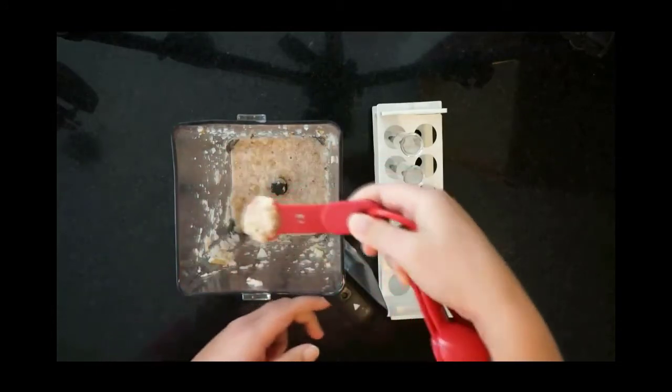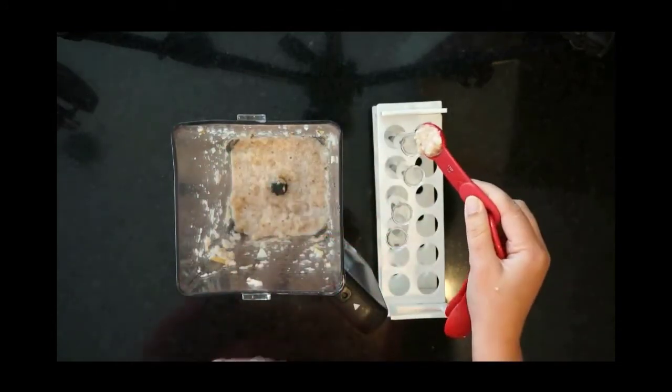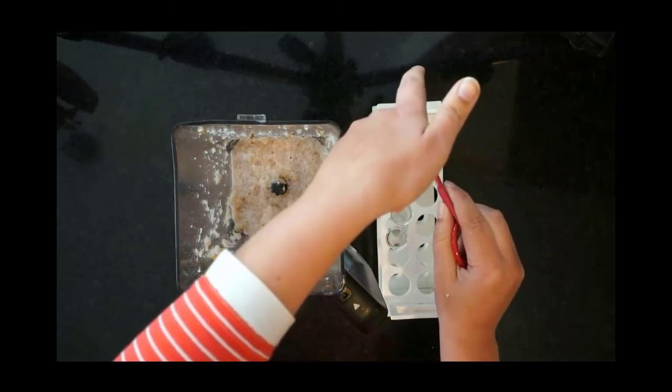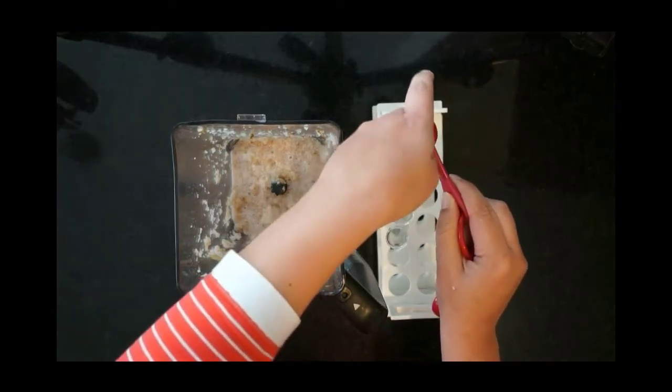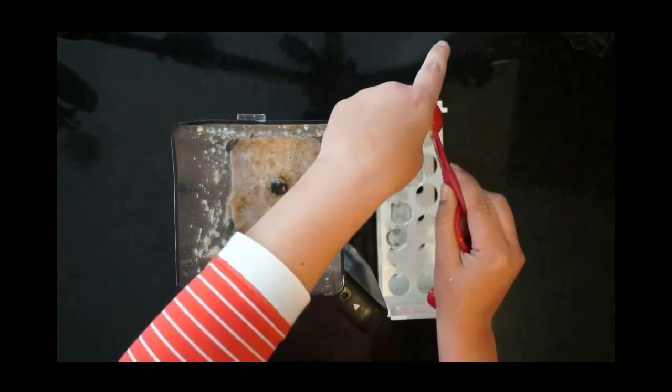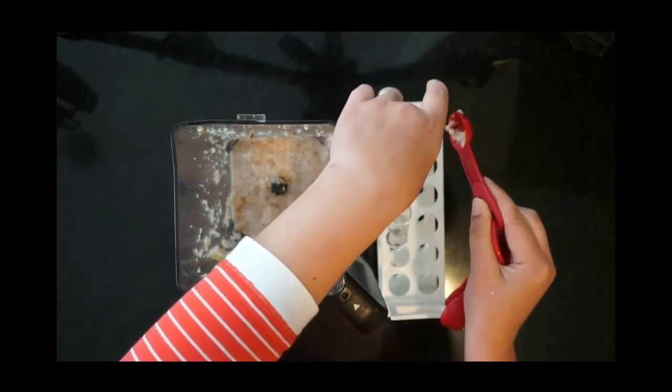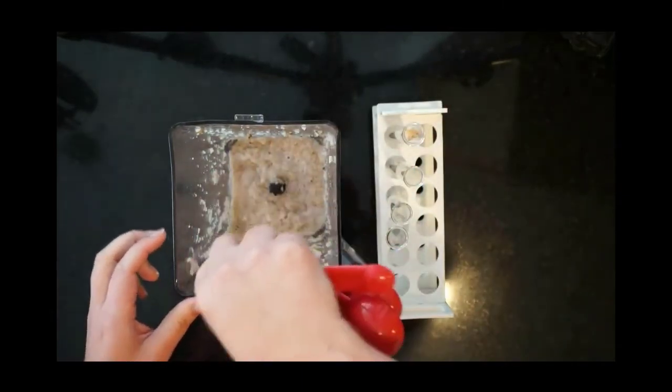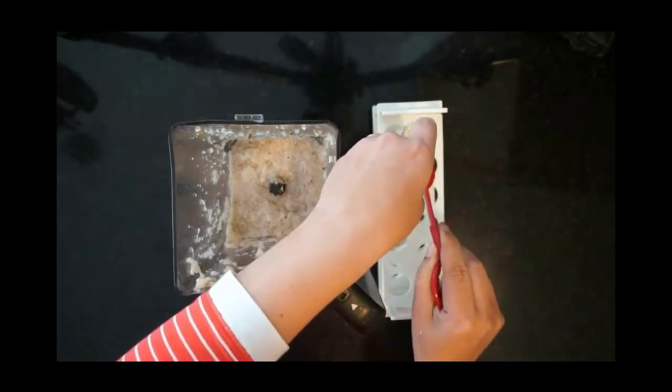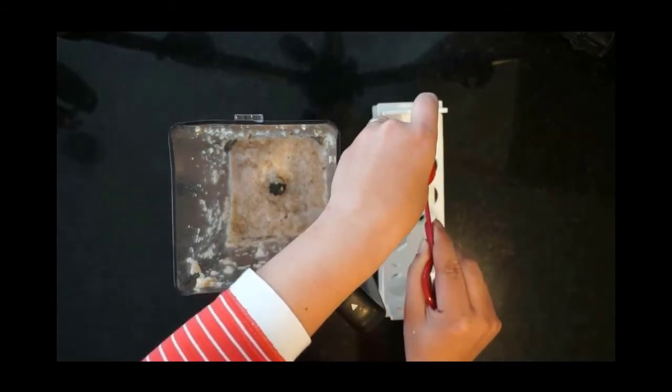Then we're going to take a teaspoon of that mixture and put it in each of the first three of your test tubes or cups. You can tap it down or push it to the bottom, but that potato mixture should be all the way on the bottom when you're done.